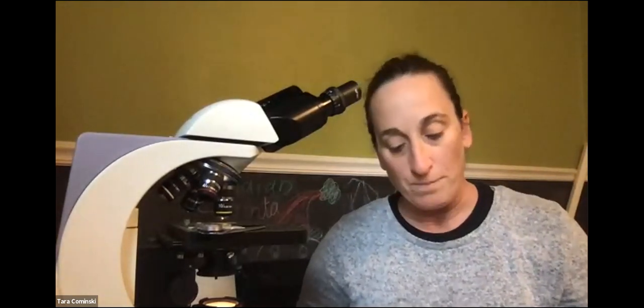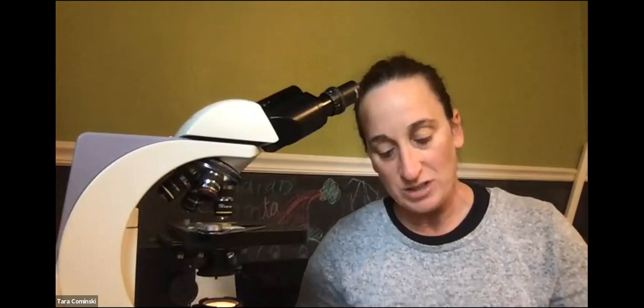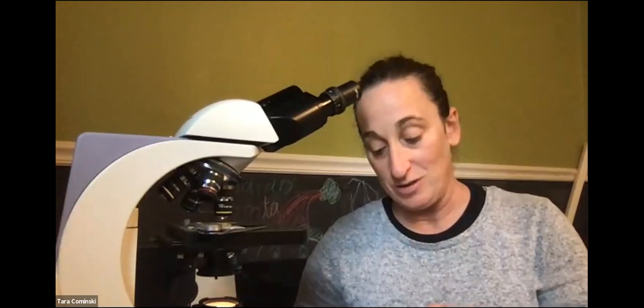If you looked under the microscope and really studied it, adjusting the fine focus yourself, you'd be able to find the nuclei as well. You're not going to count the number of onion cells, so you leave the items numbered 1 through 6 blank. You're just labeling the diagram on the right side, figure 2.11 on page 24, just label 1 and 2.